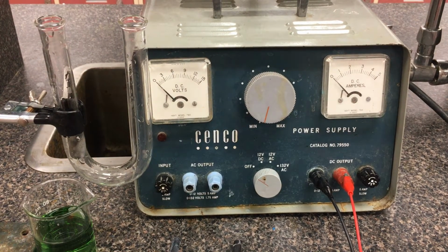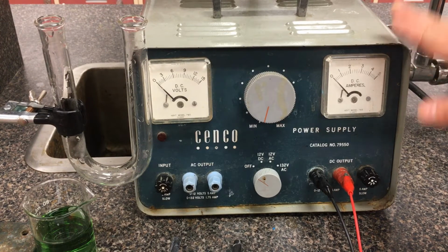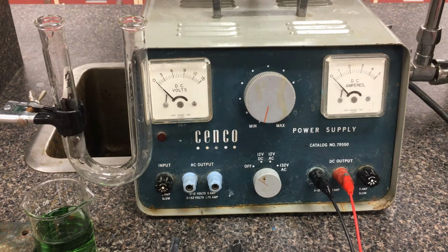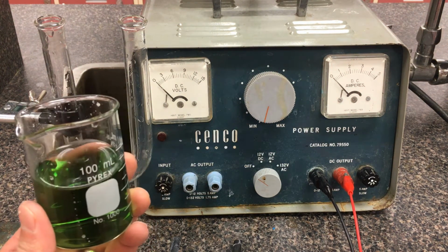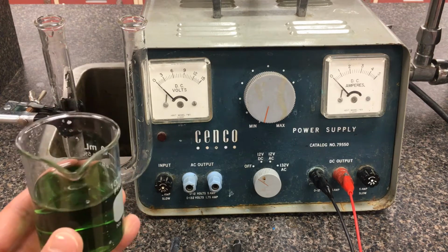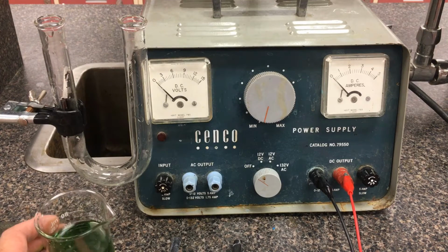Okay, so in this electrolysis lab, we're going to be using a power supply to run a non-spontaneous reaction. For part one, we're going to be electrolyzing a solution of 1 molar sodium sulfate. Currently, the solution is a green color because I've added some bromothymol blue. We know bromothymol blue switches from yellow to blue, depending on whether it's acidic or basic respectively.